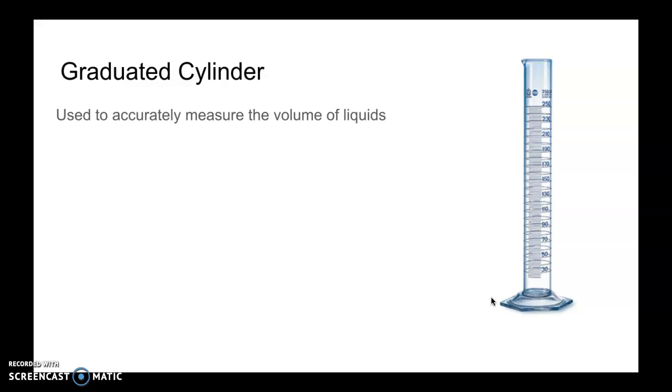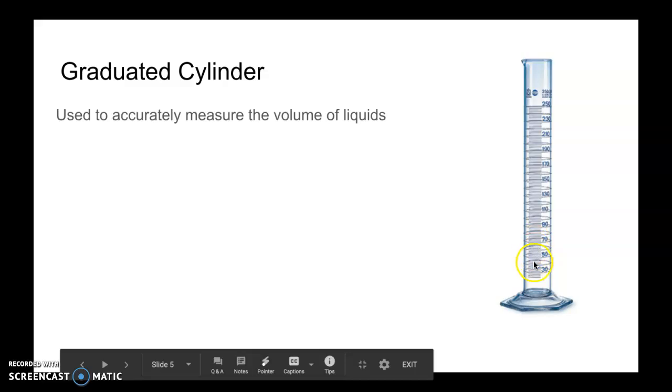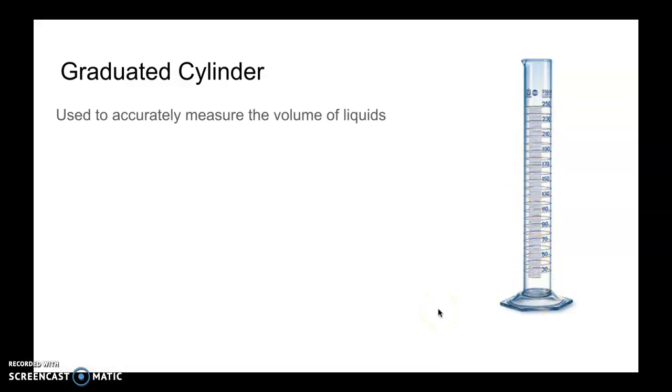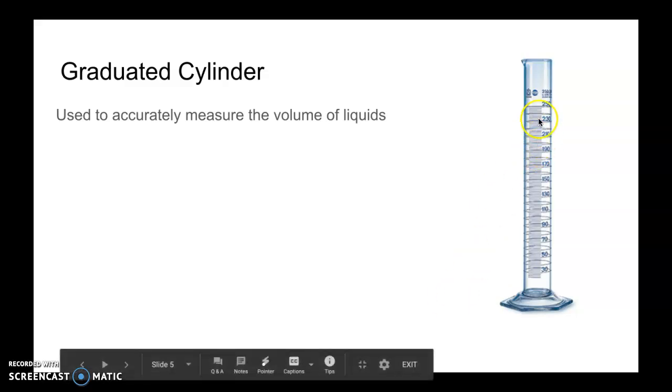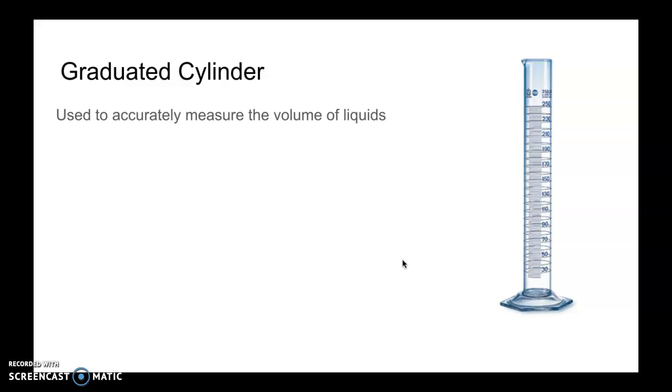This is a graduated cylinder. At Tice we have different sizes. Some are big, some are small. Some are made of plastic and some are made of glass. It gets its name because it's shaped like a cylinder and all these little dashes are called graduations. Basically those little graduations are just taking these big numbers that we can see and making them smaller so you don't have to estimate as much. This is a pretty accurate measuring tool.